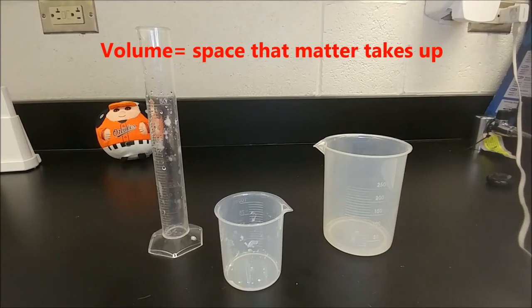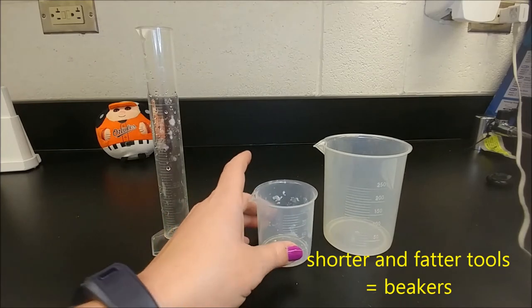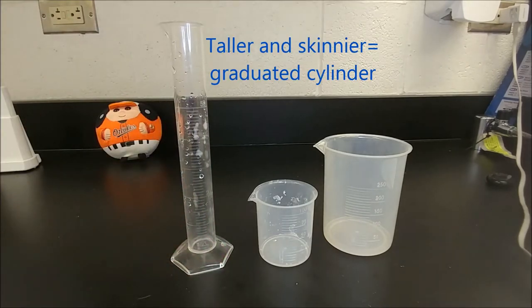These three tools are used to measure liquid volume. Volume is the amount of space that matter takes up. These two plastic ones that are shorter are called beakers. They're shorter, they're fatter, they have bigger mouths or openings. This taller, skinnier one is known as a graduated cylinder.